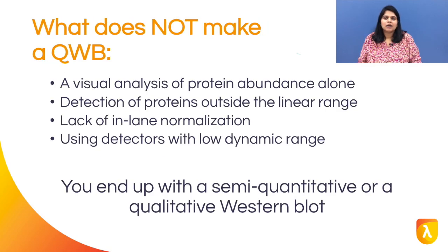Similarly, it's important to understand what does not constitute a quantitative Western blot. It is also important to understand how a quantitative Western blot is different from a semi-quantitative Western blot, even though, as we mentioned earlier, both terms are often used interchangeably by researchers. Here are a few examples of what does not constitute a quantitative Western blot.